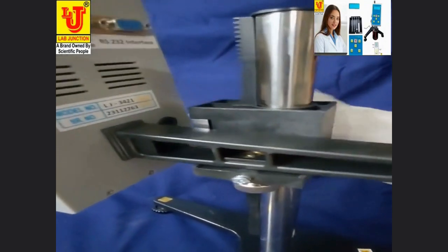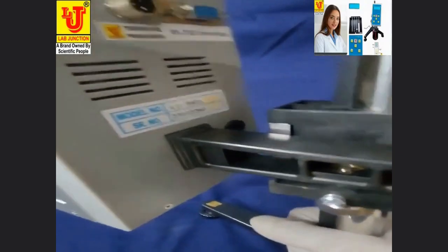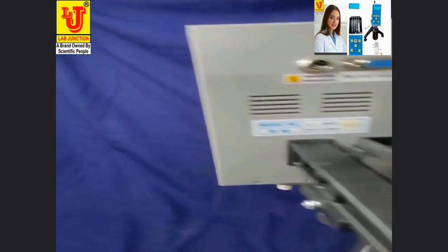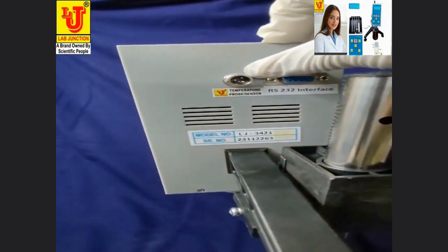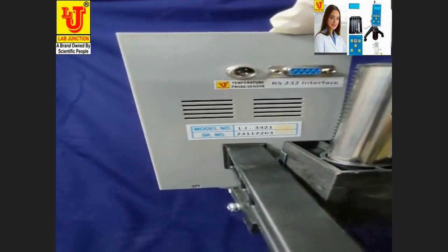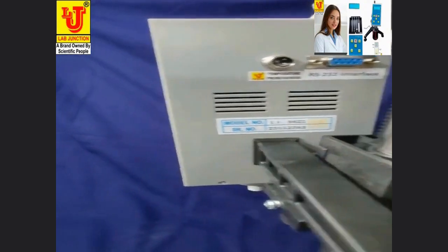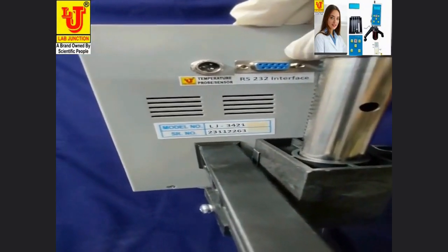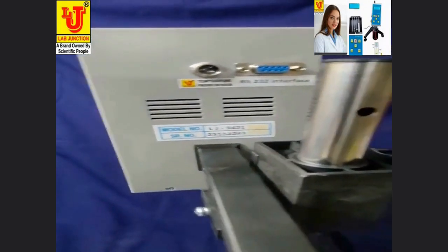Up or down. This is the back side of the display. This is the connector for the temperature probe cum sensor. And this is the RS232 interface for the printer.